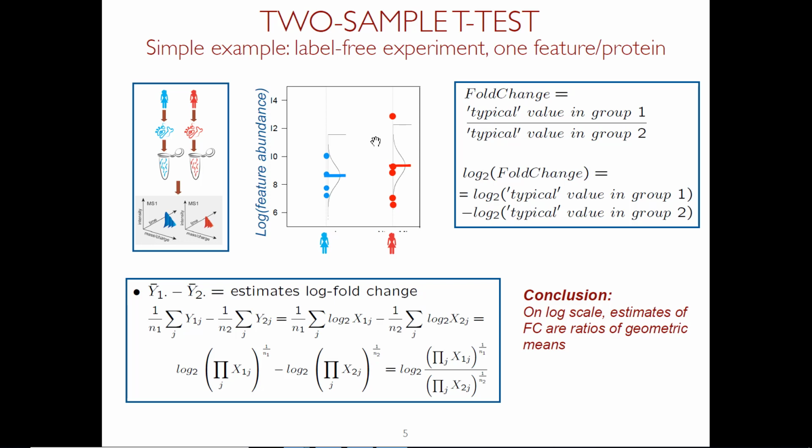And this is actually a really important comment. To compare the abundance of protein 1 to the abundance of protein 2, we need to make sure that the peak intensities are comparable. And we of course know that they will have different amino acid sequences, different ionization, different interferences. It is a very different proposition to take the same peptide, which has the same chemical properties, and look at this across multiple subjects. So what I'm talking about here today is really looking at the same peptide or same set of features across multiple subjects. Some of them come from healthy, some of them come from disease. I want to know if the representative value in the healthy is comparable with the representative value in the disease.